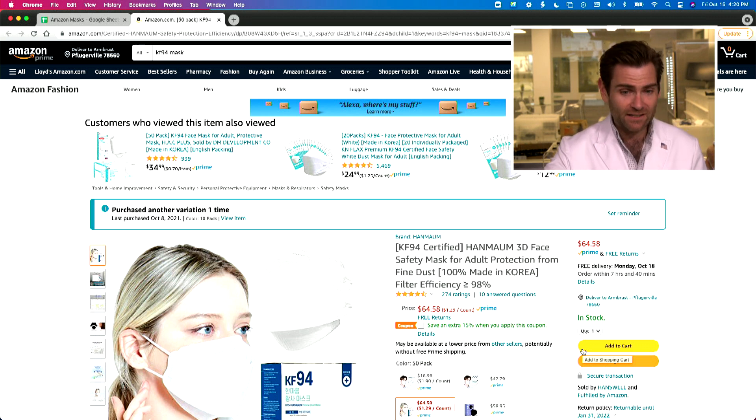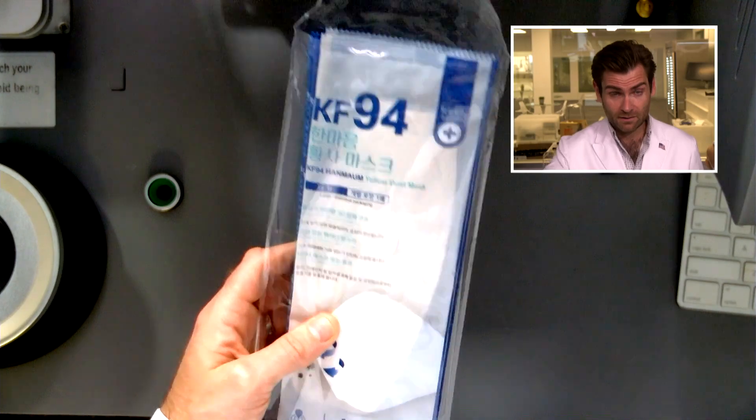This is the KF94 Hand Mom 3D Safety Mask. Let's put it in the clamper and see what happens.